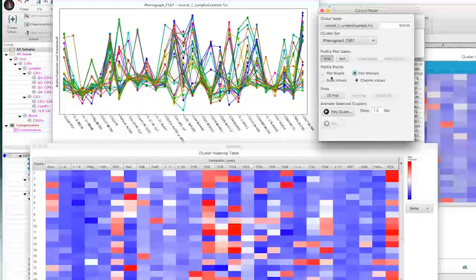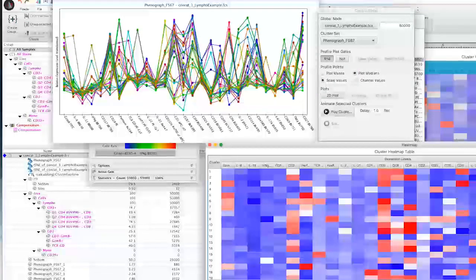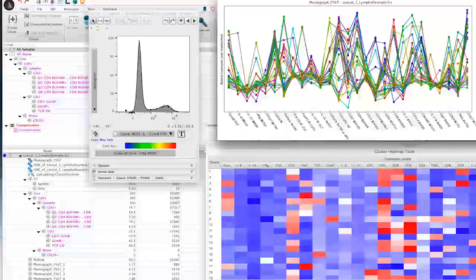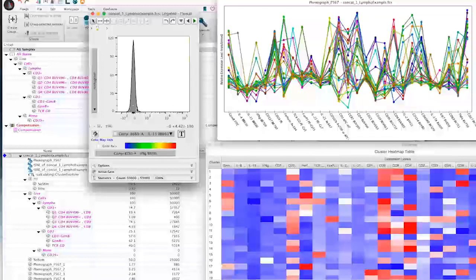When you go into scale values, you're talking about raw data as it's displayed here in the visual. And now you've got higher numbers out. There's the potential in certain cases, of course, that you would get negative, like less than 0 MFIs.